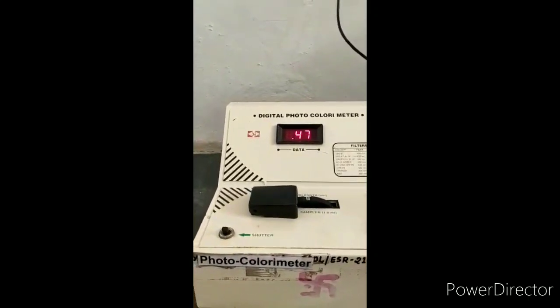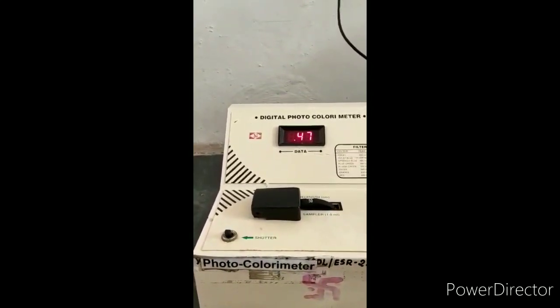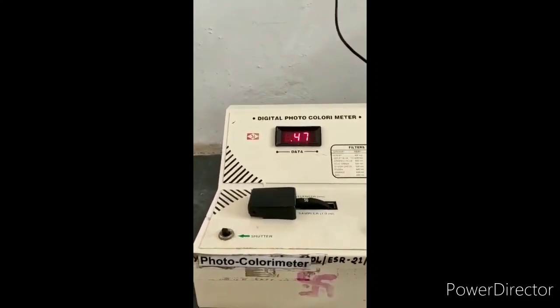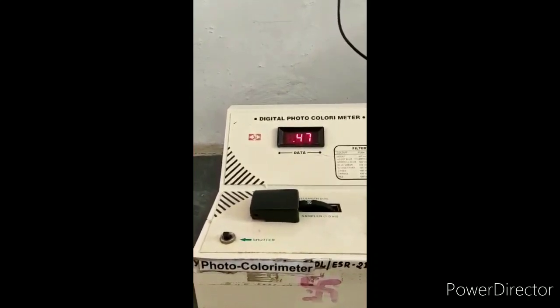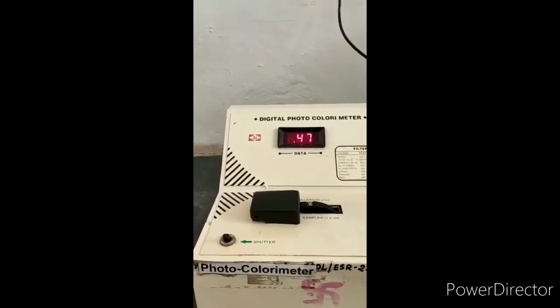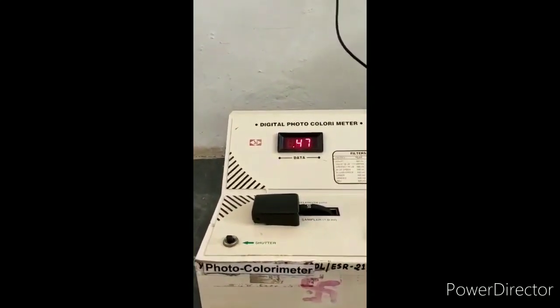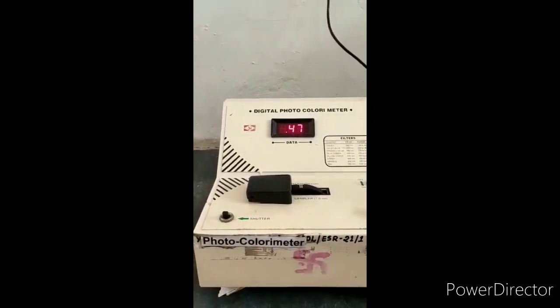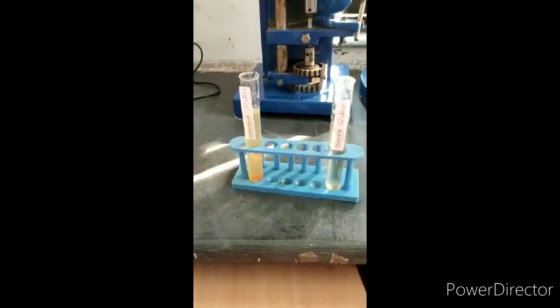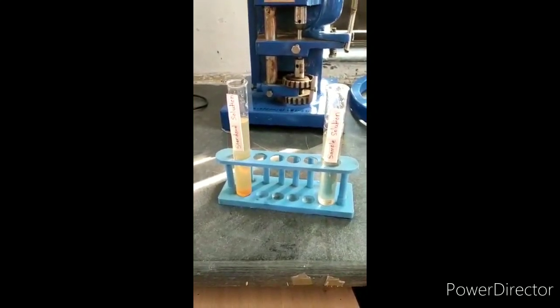Here we observe that the color intensity of the sample solution is less than that of the standard solution. The absorbance reading for the standard solution is 0.47 and for the sample solution is 0.37. Therefore, the absorption of the standard solution is more as compared to the sample solution, confirming the suitability test result.